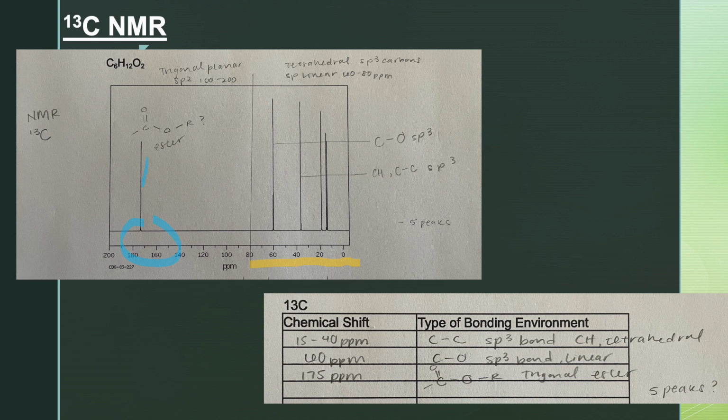And then another thing to look at is the number of peaks, which is kind of hard to tell, but there's either 5 or 6, so you're going to look at these peaks that are here. And this one, I think, has 2 in there, so I'm going to say 6 unique peaks representing 6 symmetrically inequivalent carbons. So these carbons are absorbing at different shifts, and this is going to be important to know at the end when we're looking at a possible structure.